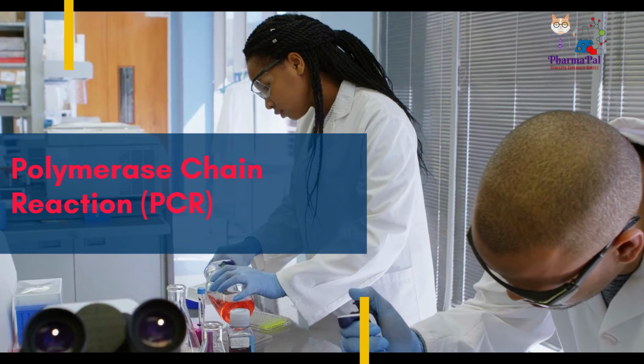After PCR, gel electrophoresis is often used to verify the fragment size and assess product purity. Additional techniques like blotting and hybridization can also be used to identify specific sequence regions. PCR has a wide range of applications, including cloning specific sequences, forensic DNA fingerprinting, and diagnostic procedures for genetic disorders. Its versatility and accuracy make it an invaluable tool in the field of molecular biology.